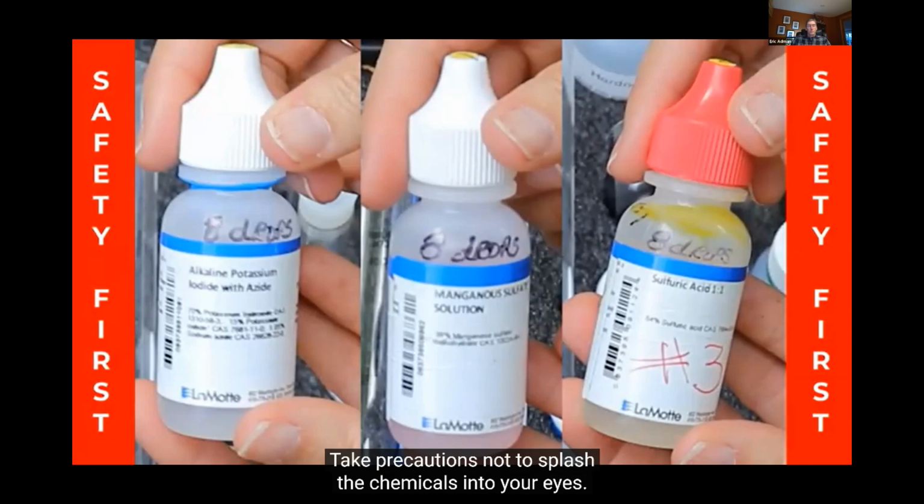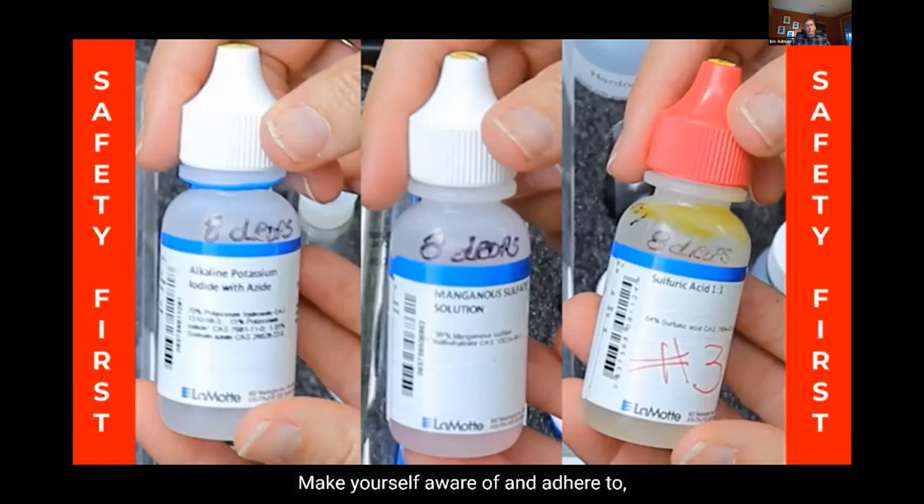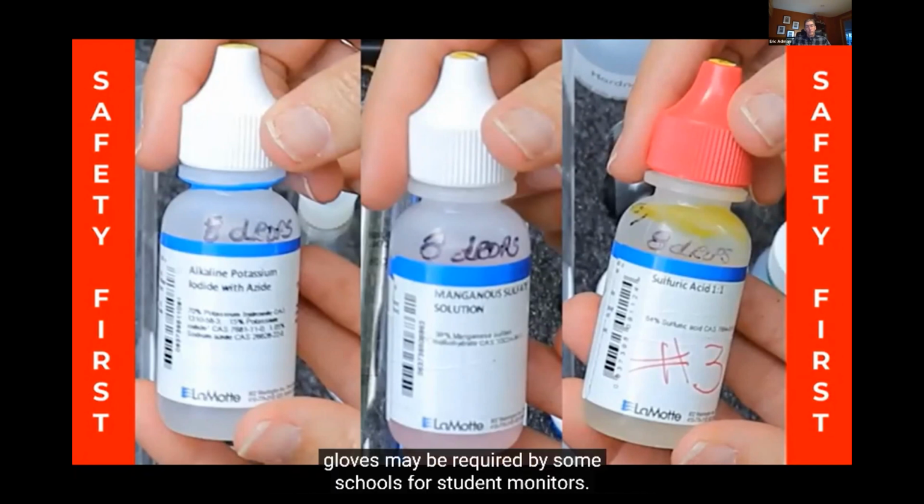Take precautions not to splash the chemicals into your eyes. If you get reagent on your skin, rinse with water. Youth using these chemicals should be carefully supervised. Make yourself aware of and adhere to the recommended 4-H AWW safety protocols. Safety glasses, and in some cases gloves, may be required by some schools for student monitors.